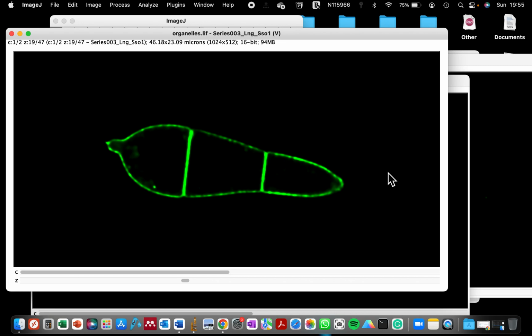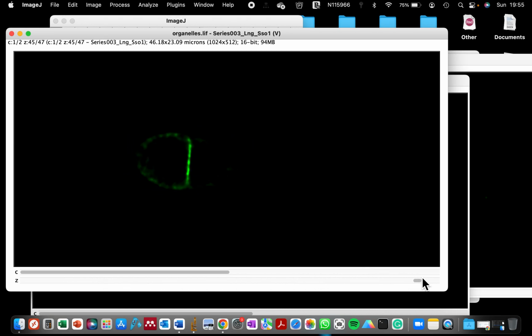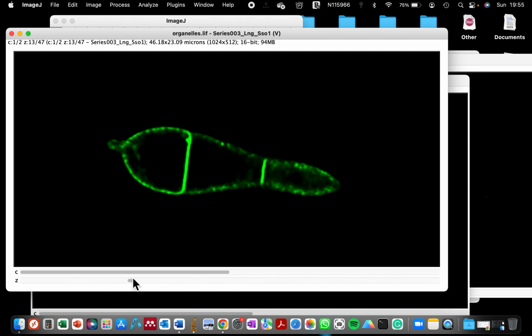In today's video, I'm going to show you how to convert a Z-Stack image into a 2D image. And I always encourage people that are doing live cell imaging that it's important to take a Z-Stack. A Z-Stack image is a three-dimension image, XYZ kind of image.